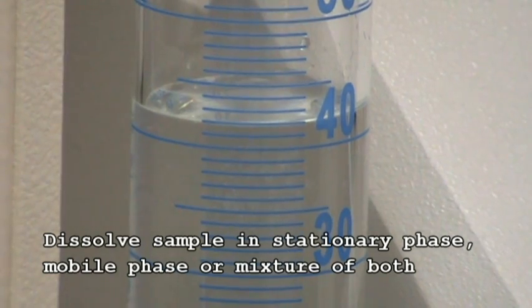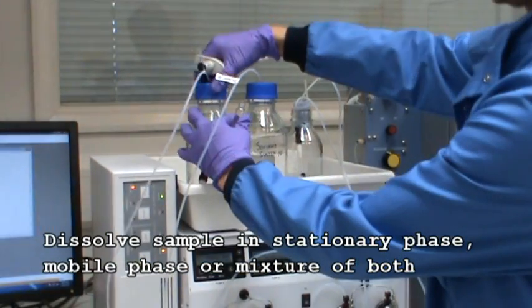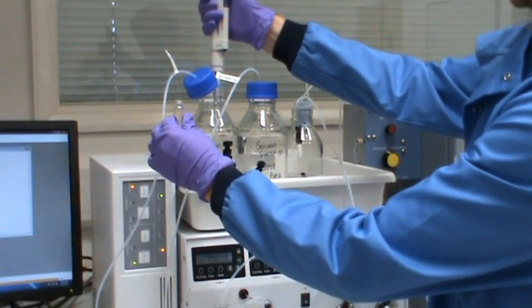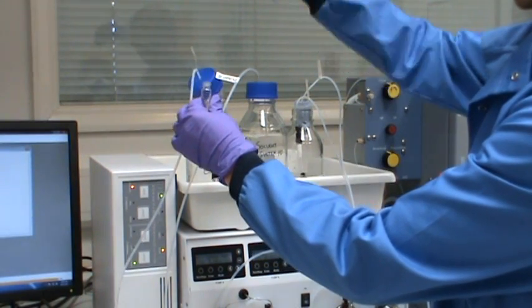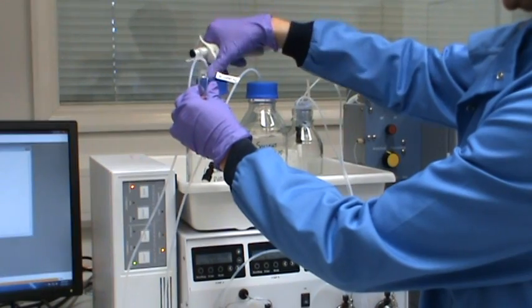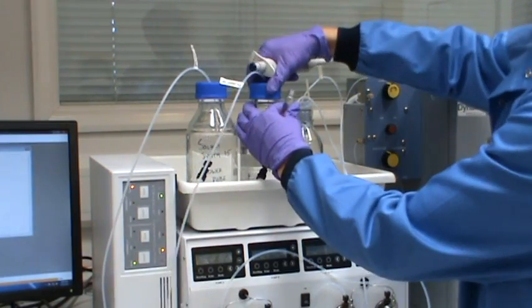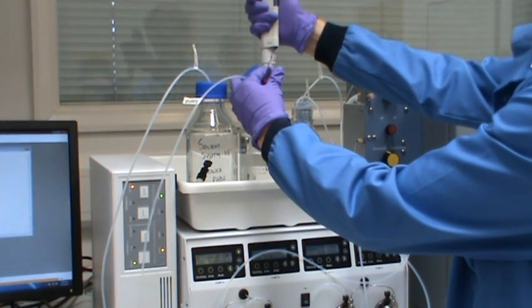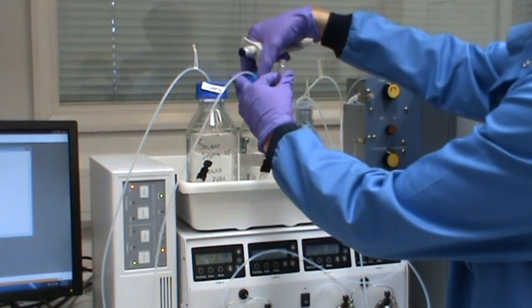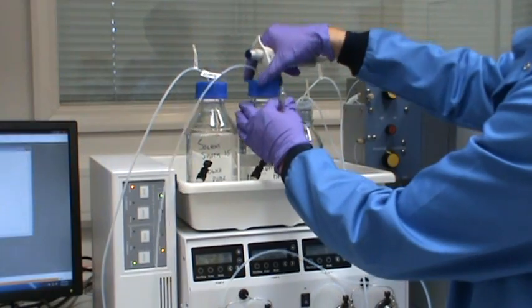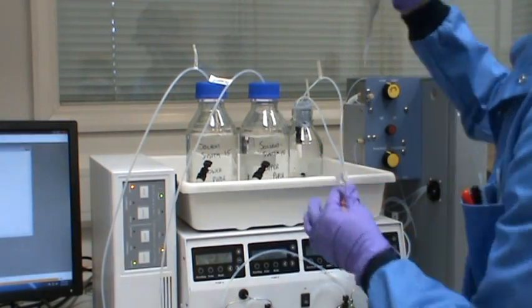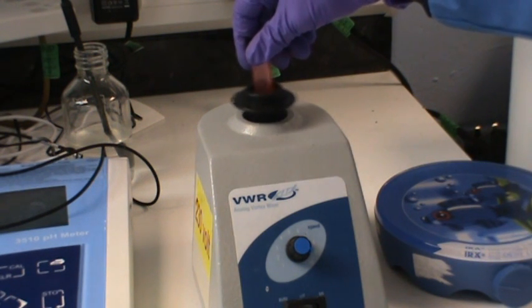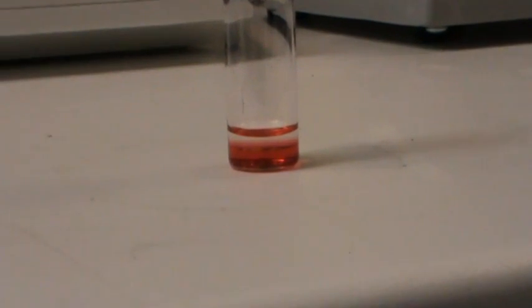Dissolve your sample in a mixture of mobile and stationary phase, approximately 1 ml of each. Make sure the sample is fully dissolved. You should see two solvent layers in the sample.